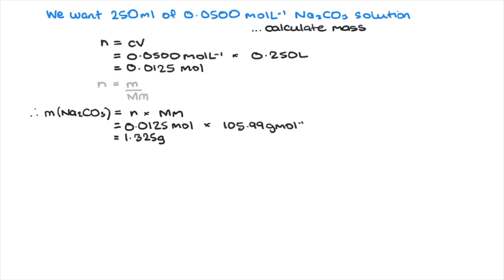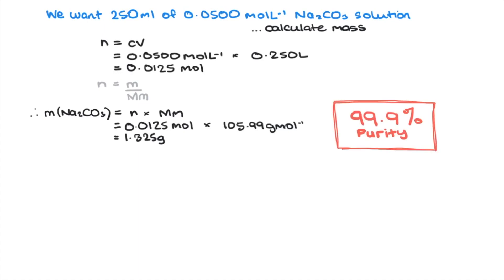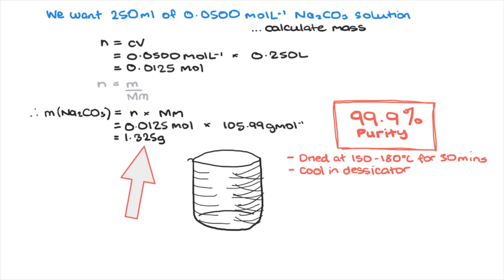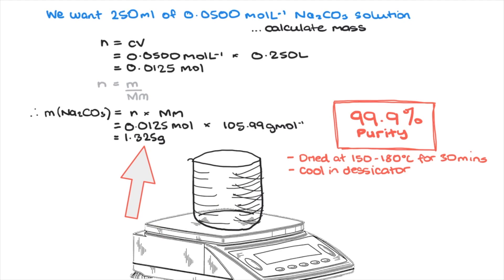We use lab-grade anhydrous sodium carbonate — anhydrous meaning there is no water — with a purity greater than 99.9%. The solid is dried at 150 to 180 degrees Celsius in a drying oven for 30 minutes, then allowed to cool in a desiccator containing drying crystals. The dry solid is then weighed into a dry 50 mL beaker on an electronic balance to at least three decimal places.